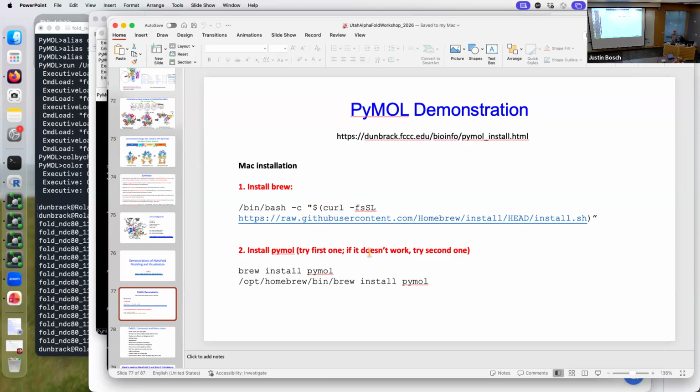There's another program called ChimeraX, from UCSF. Really powerful. It does a lot more things than PyMOL does, and actually has a really good interface with AlphaFold models. It can read in a PAE matrix, and you can select part of a PAE matrix, and it will show you on the protein where that part is. So you could look at one of those off-diagonal rectangles and figure out, oh, okay, now highlight those on the structure. They've added the ability to interpret AlphaFold 2 and 3. I think it's both 2 and 3 interactions. So ChimeraX is really powerful.